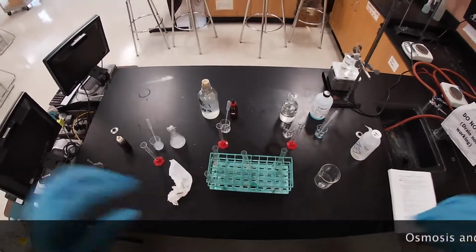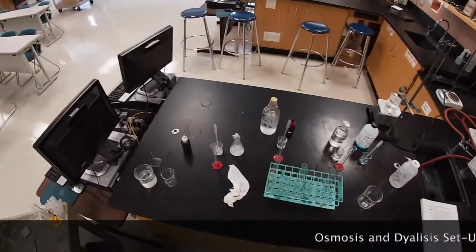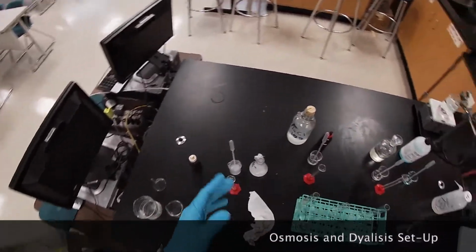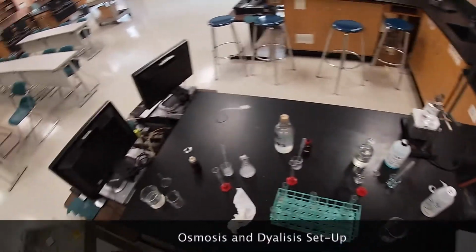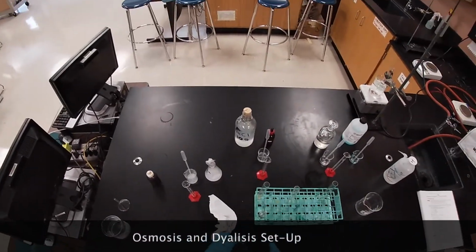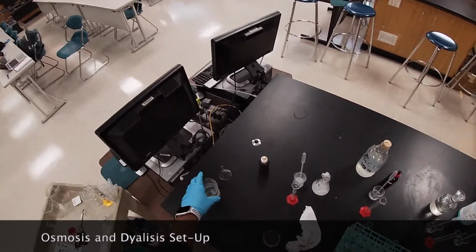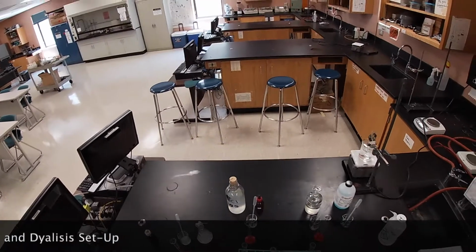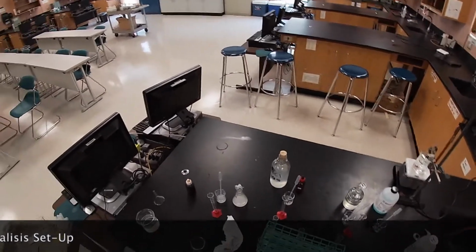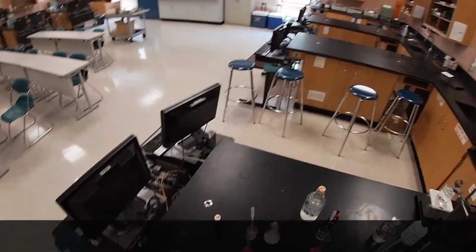For our next step, we're actually going to measure out 10 milliliters of our starch solution, sodium chloride solution, and glucose solution. We're going to put it in the beaker. Then we're going to get our dialysis tubing, which is located right here. We're going to take it out, tie a knot on one end, and then add about 20 milliliters of that solution into the dialysis tubing.